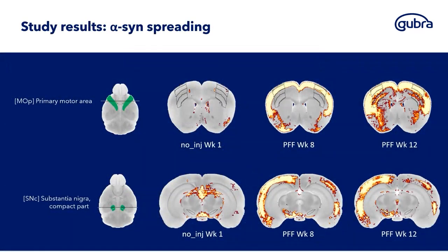All right. So on this slide, we took the segmentation masks and we extracted some endpoints from the segmentations. So in this case, on top of doing the alpha-synuclein segmentation, we also did an atlas registration, meaning that we inferred a brain atlas onto our samples. And by doing this, we can make some visual average representations of the alpha-synuclein spread. I provided here 2 examples.